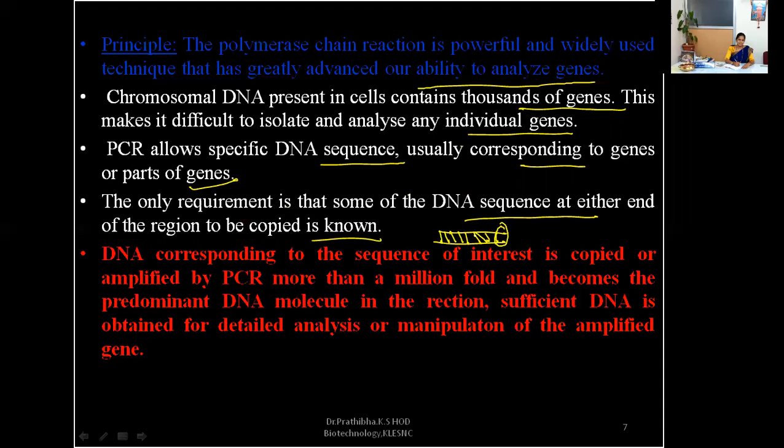Or if your DNA is here but your known sequences are here, these particular sequences must be known to prepare primers. Why should we know the two ends of the DNA sequence to prepare primers? Just keep it in your mind. In the next slides you'll be able to make it out.